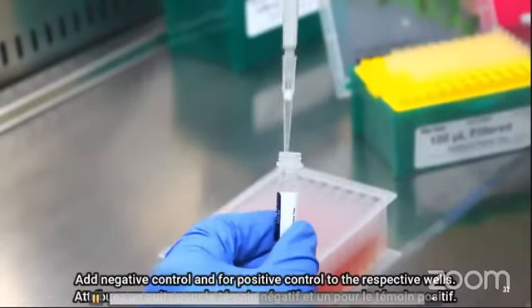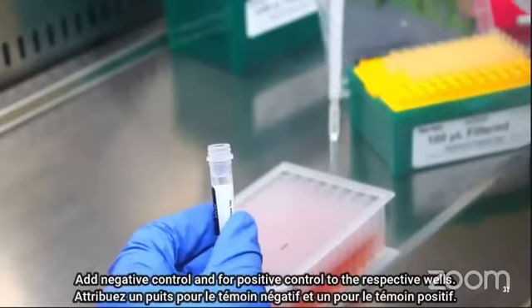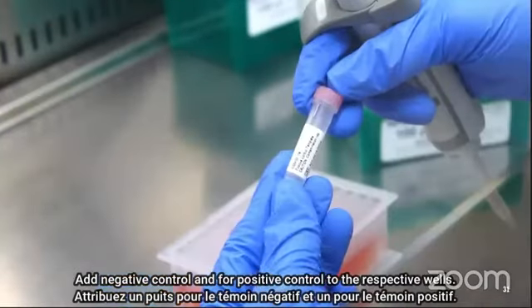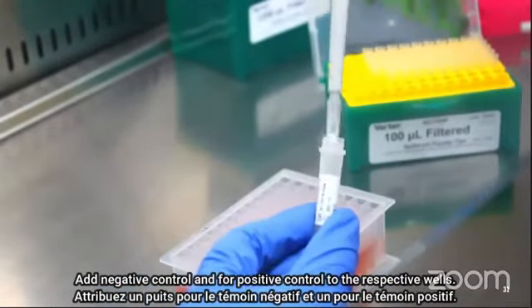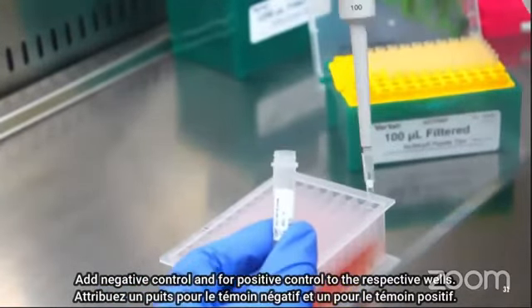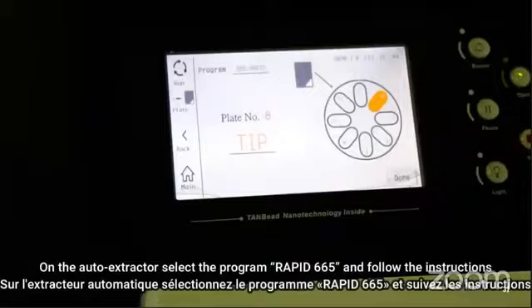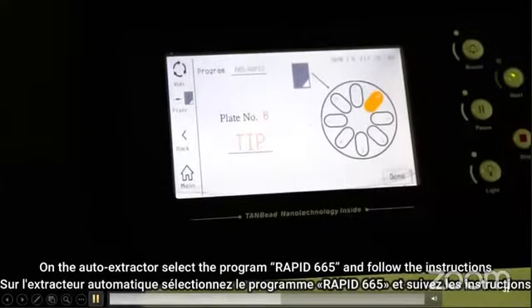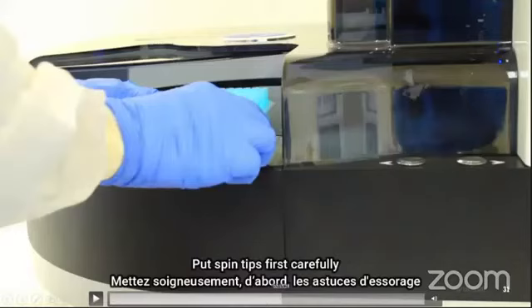After addition of the negative control, we assign some wells for these controls, negative and positive control. Now we are going to add the positive control. So after this, we have extraction negative control, extraction positive control, and different samples in our deep well plate.